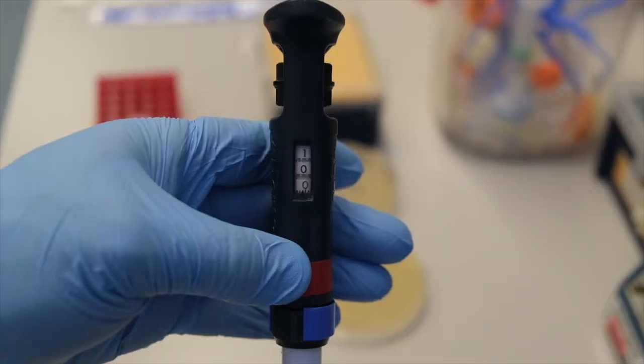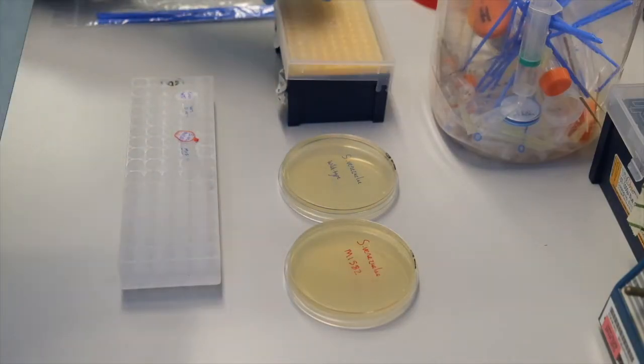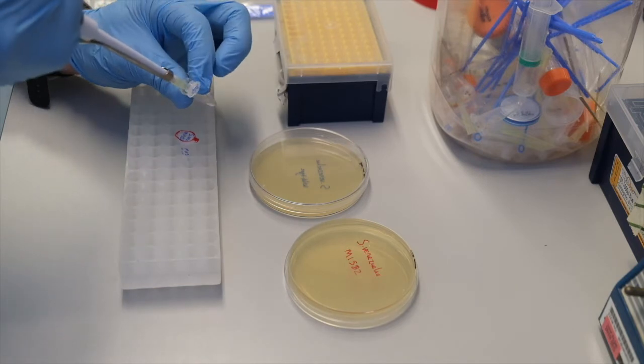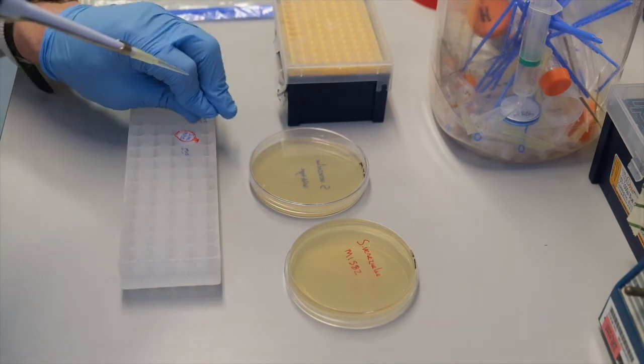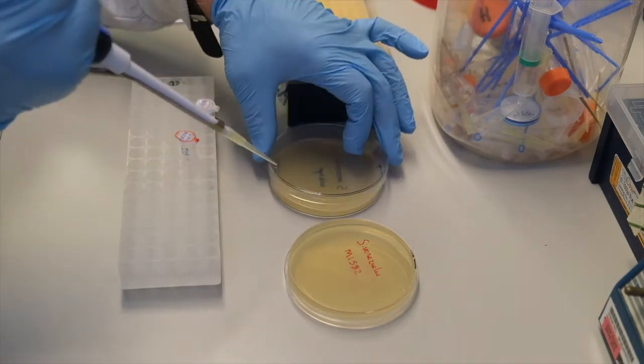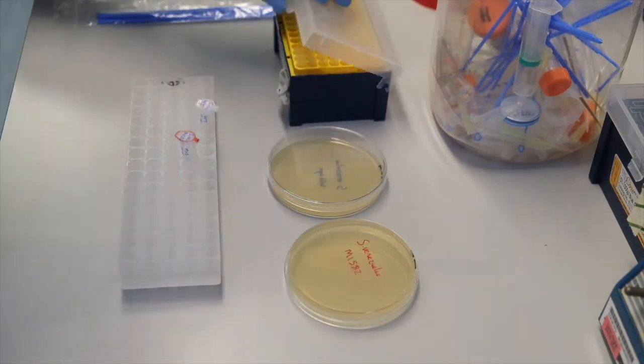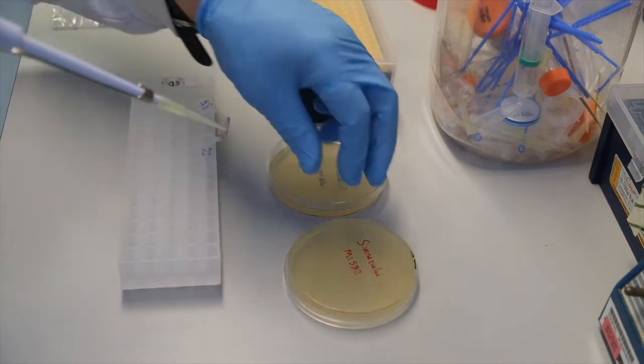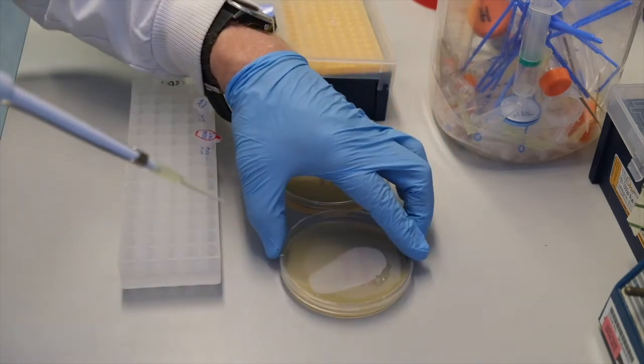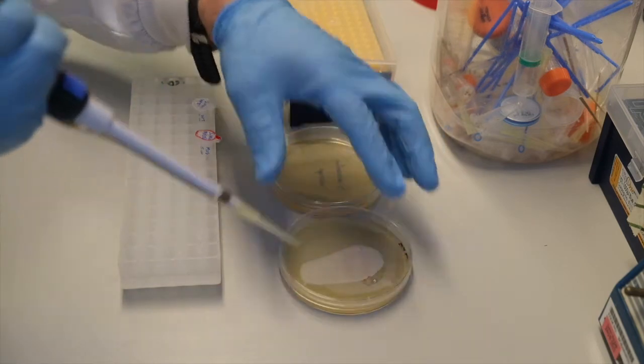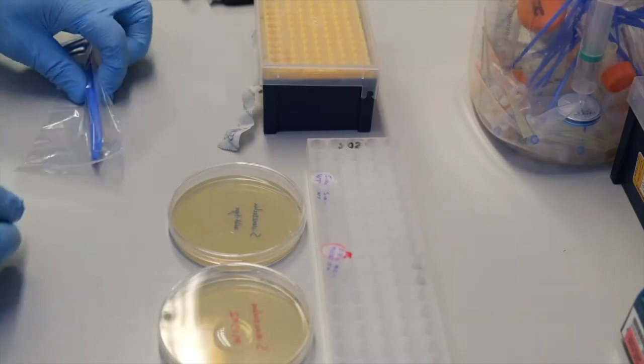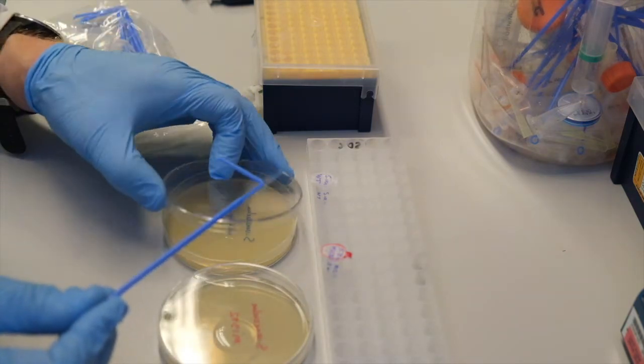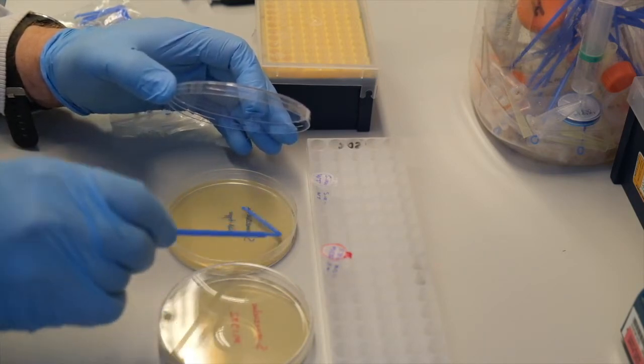We will pipette 100 microliters of spores onto each plate, wild type onto one plate and M1582 onto the other. We spread the spores evenly over the plates using a fresh spreader for each plate.